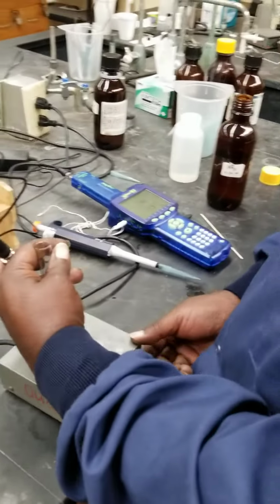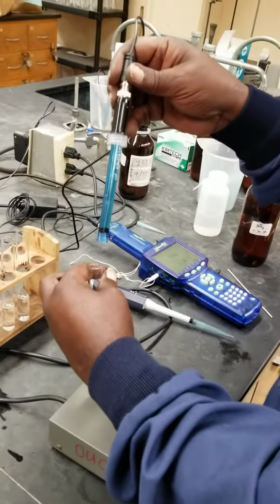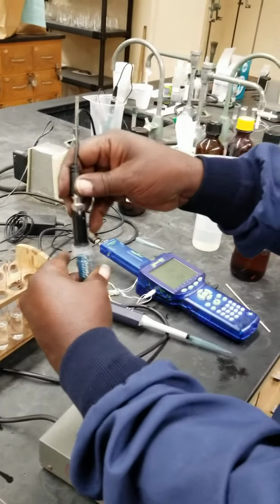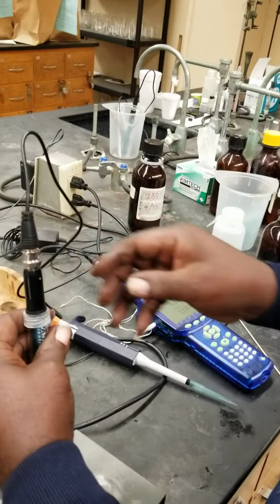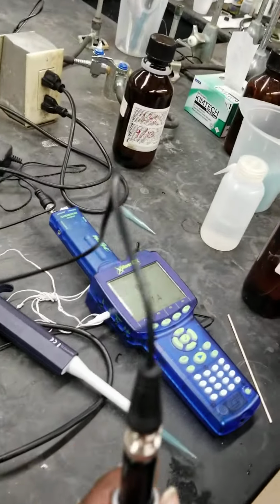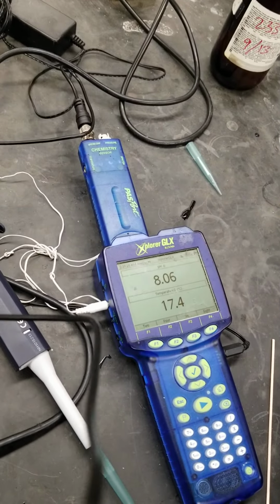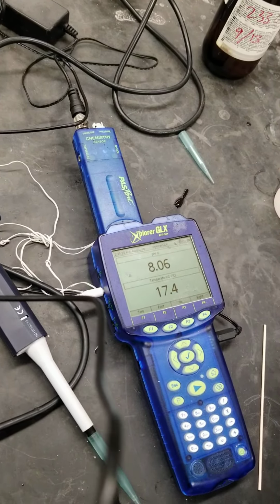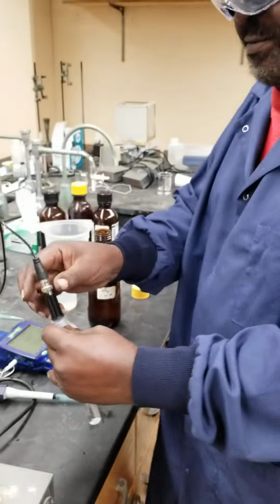Mix. Turn that off. Put in my electrode. Up and down a little. And then read the pH. Let's read that as 8.06 after adding the first 3 milliliters.